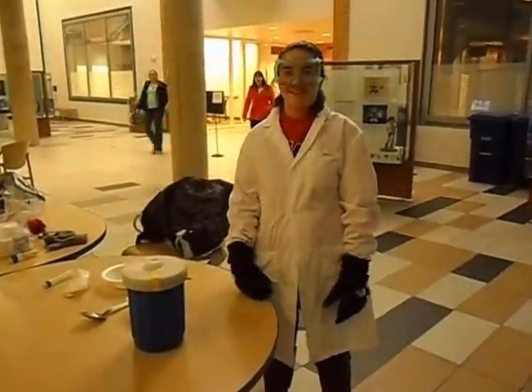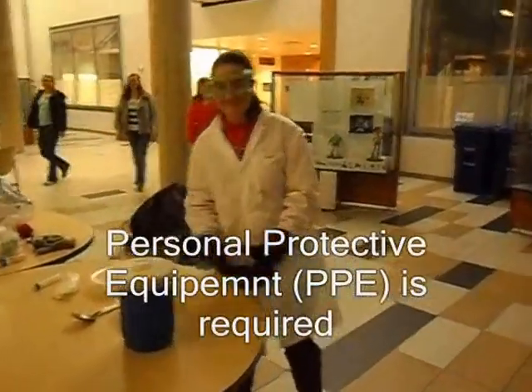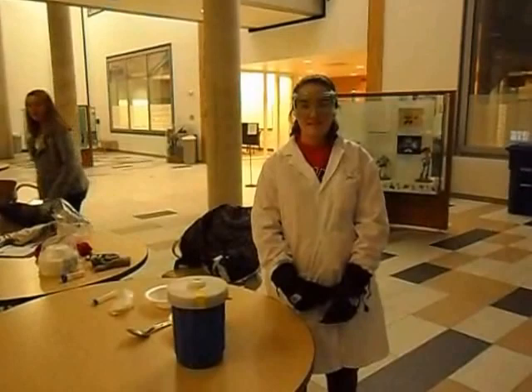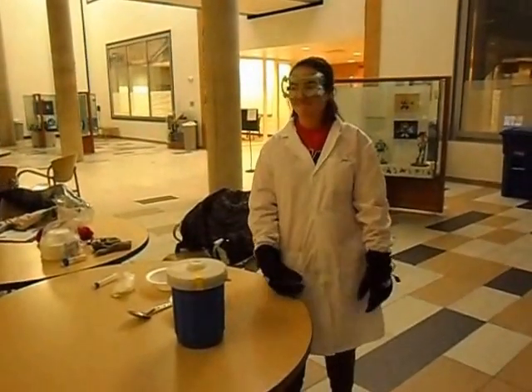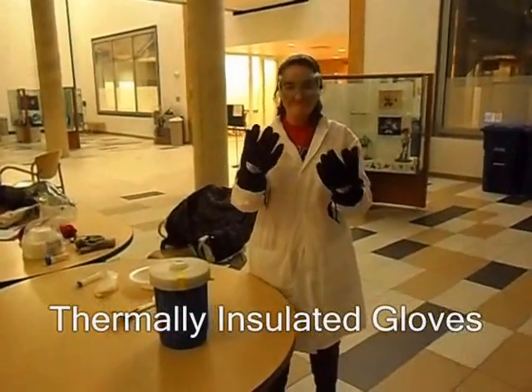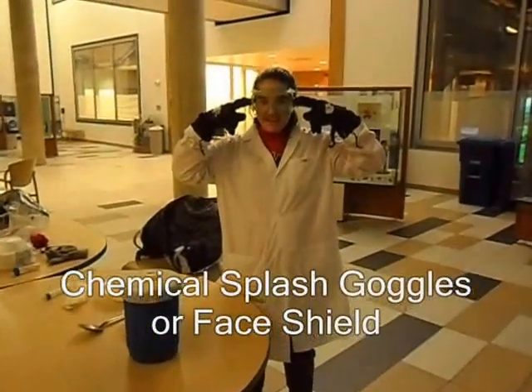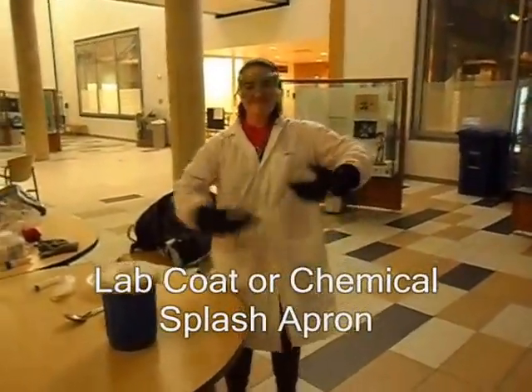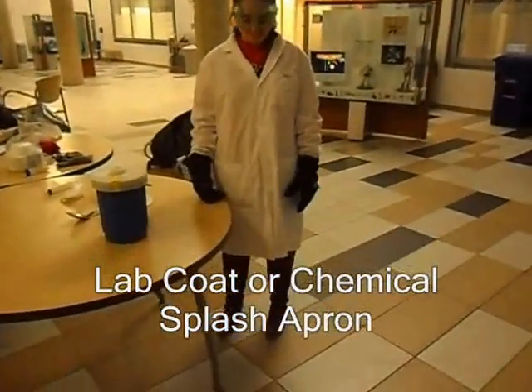There is some safety equipment that is required for liquid nitrogen use. These safety equipment may include, but are not limited to, gloves that are rated for very cold temperatures, safety goggles — alternatively a face shield can be used — a lab coat or chemical splash apron, and closed-toed shoes with long pants.